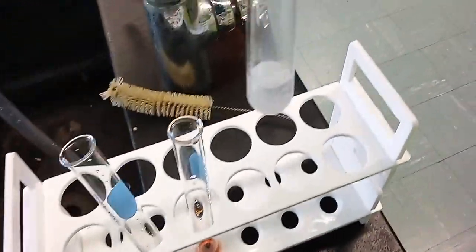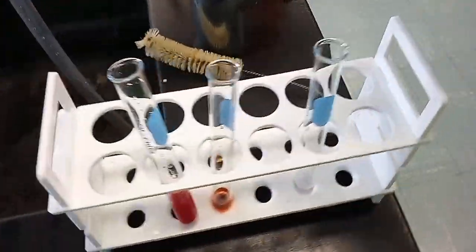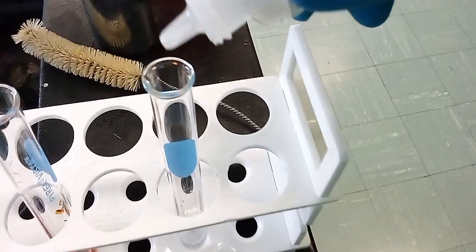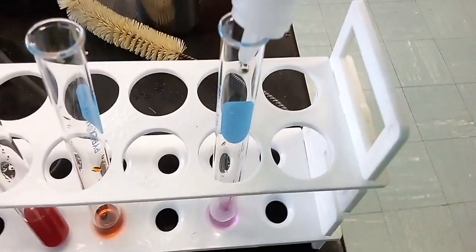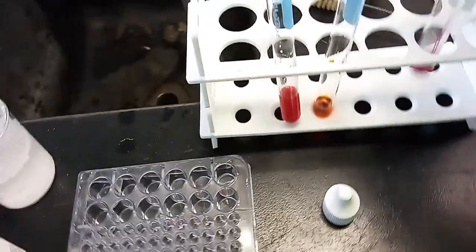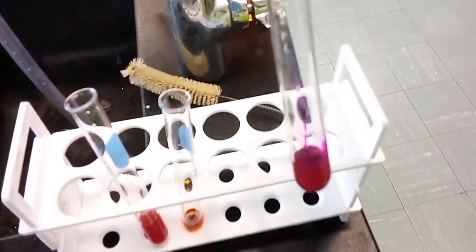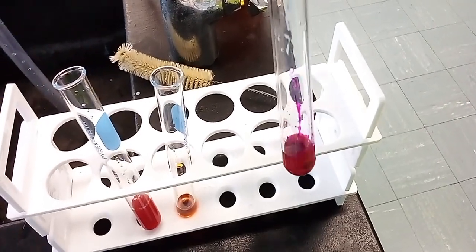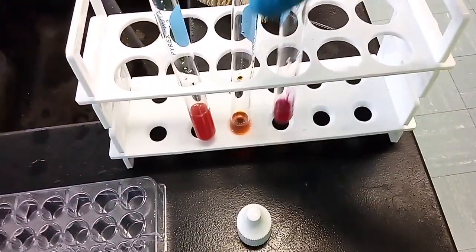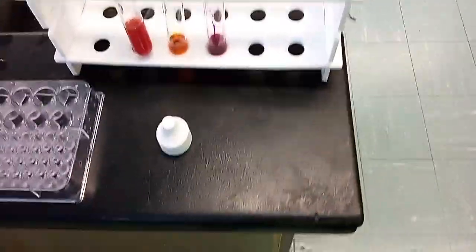Now I have here phenolphthalein. You can see that it's clear. If I add a drop of potassium hydroxide, because it's a base, it's going to turn pink. You can see that it turns into an intense pink relatively quickly. Very intense pink color. So it's quite amazing. And this is why I like chemistry, because you can change the color of things, and it's like magic. It feels like you're doing magic tricks in here.